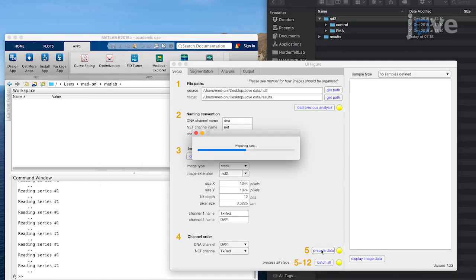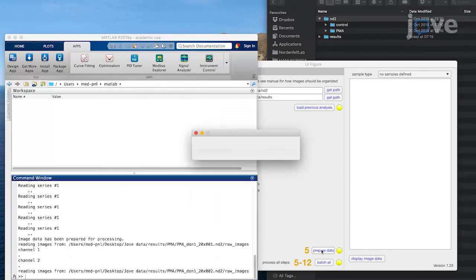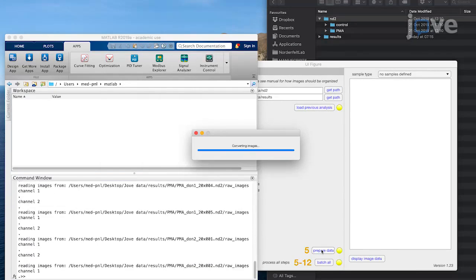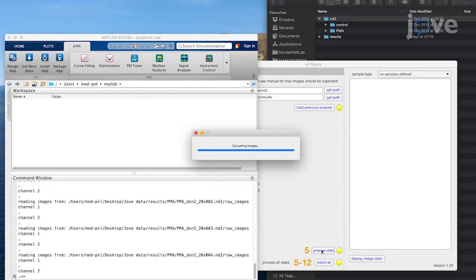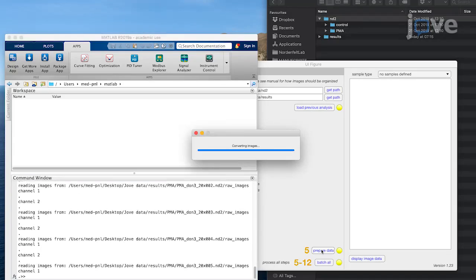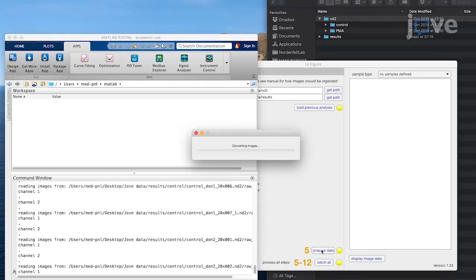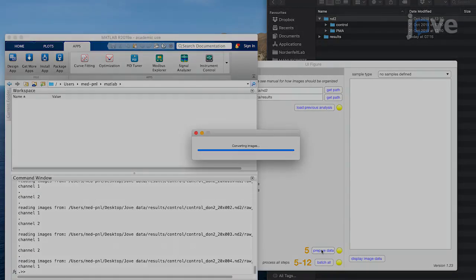Click on the Prepare Data button to acquire primary image properties from the raw data and convert the images. The converted images will then appear in the Sample Type submenu.